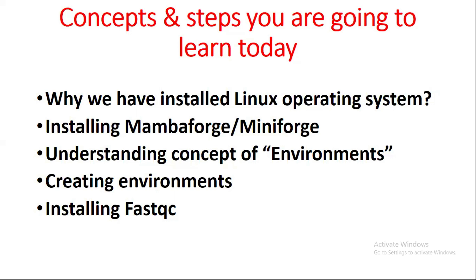I discussed this in the previous video but will cover it in a little more detail here. I will show you how to install Mambaforge/Miniforge, explain the concept of environments in Linux, how to create environments, and how to install the FastQC tool. Today's video will be partly theoretical and mostly practical.